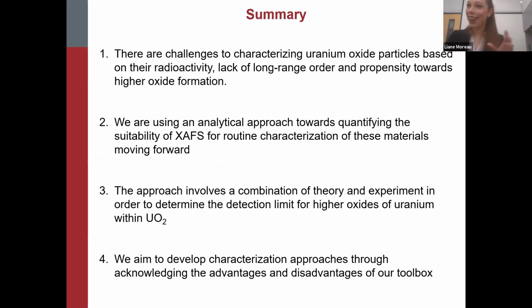And so with that taste of some of what we're working on to solve some of these problems moving forward, there are some challenges to characterizing uranium oxide particles based on these different parameters that we've mentioned, using an analytical approach. So we're trying to hone in on analytical chemistry and the skills and tools related to it towards quantifying the suitability of XAFS for routine characterization of these materials, and figuring out to what extent we would be able to tell if there were higher oxides present or not. This approach involves a combination of theory and experiment, mostly simulations versus experimental data, in order to estimate the detection limit for higher oxides of uranium within UO2.